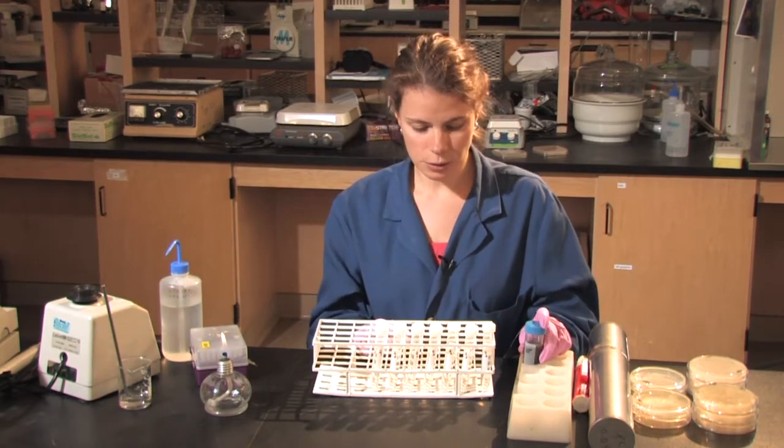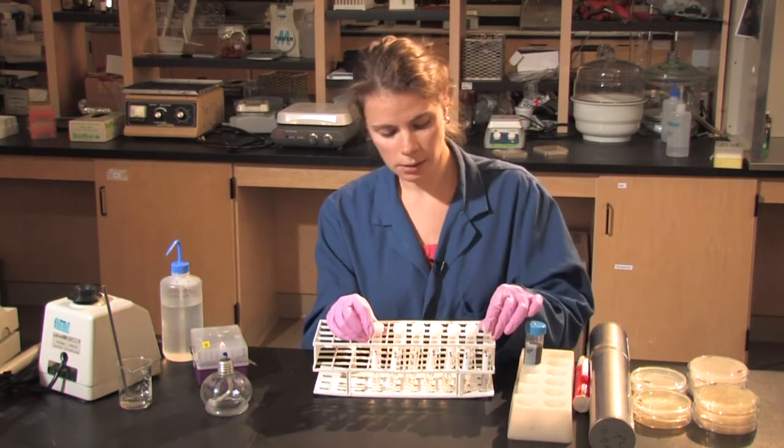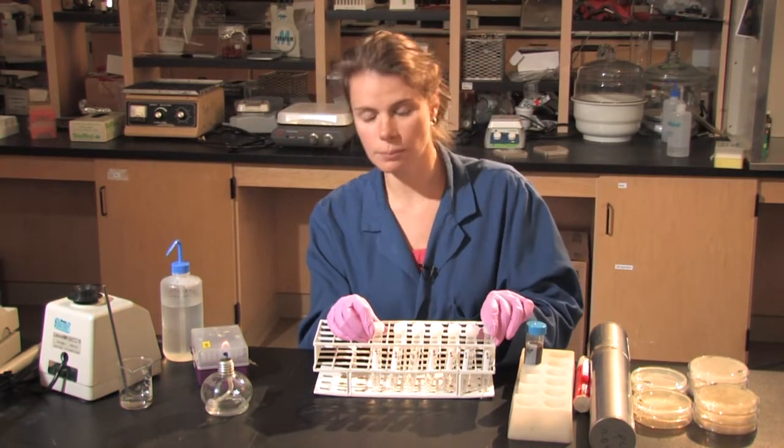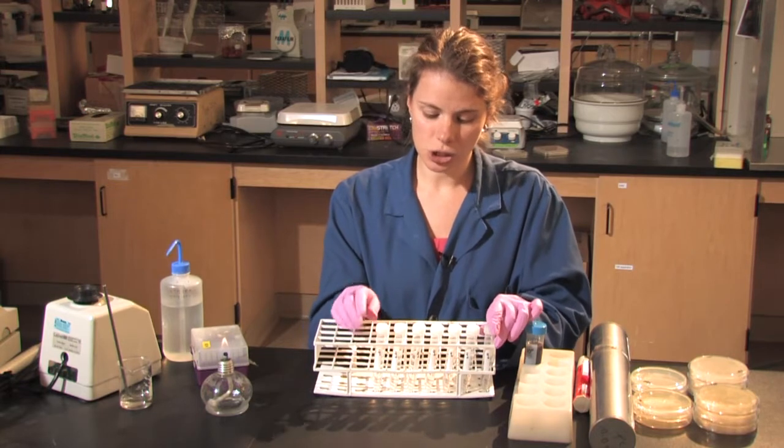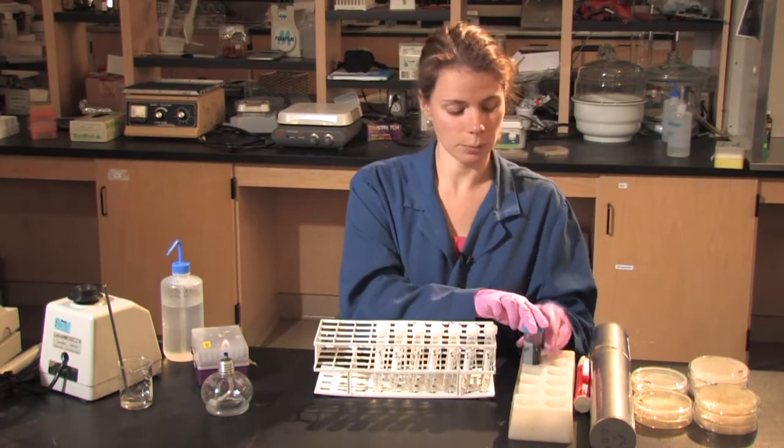I'm then going to do a serial dilution from about 10 to the minus 1, 10-fold, to about 10 to the minus 7. And this should give me a better idea of the counts within the soil sample.